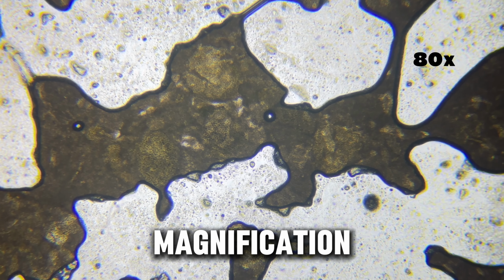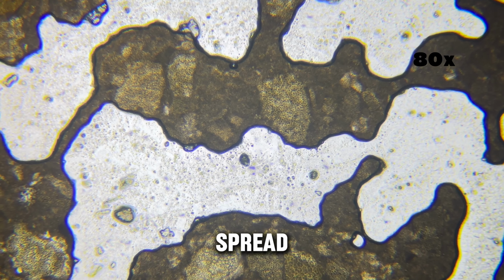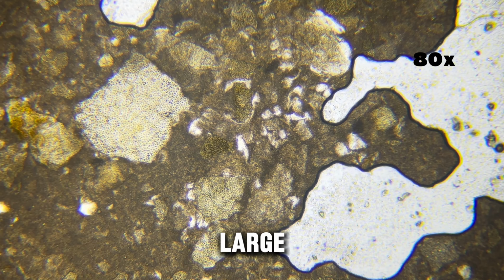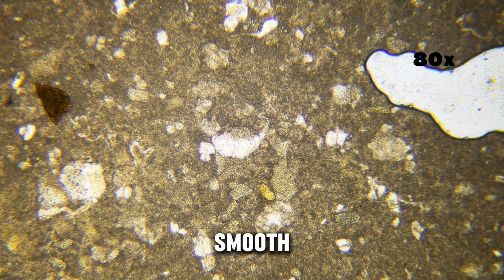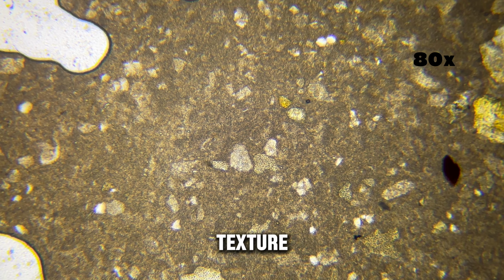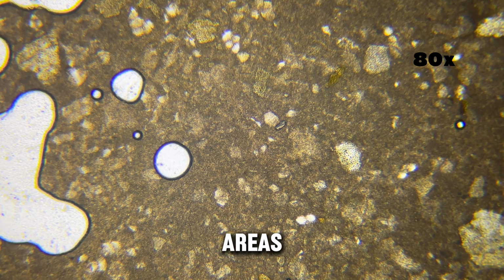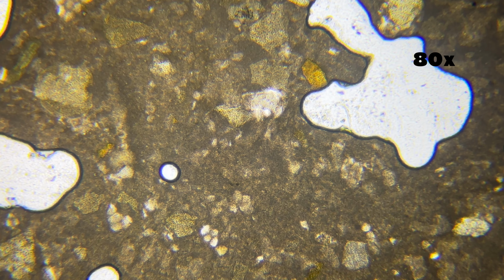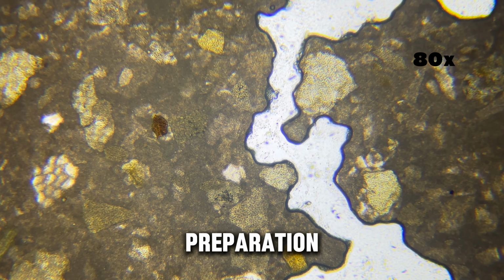At 80 times magnification, the mustard sample appears as a thick and uneven layer spread across the slide. The surface looks dense and compact, with large dark regions dominating the field of view. The familiar smooth appearance of mustard disappears almost immediately. Instead, the texture appears rough, broken, and irregular. Wide areas of muted yellow and brown tones are visible throughout the sample. These regions come from crushed mustard seeds that were pressed flat during preparation.